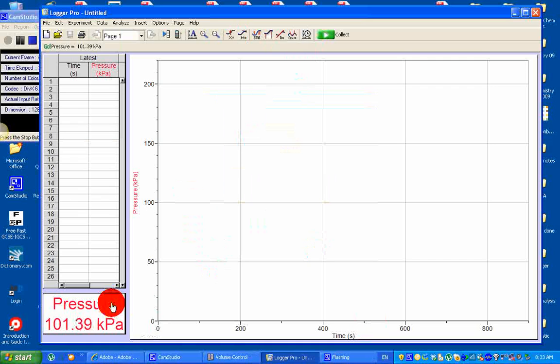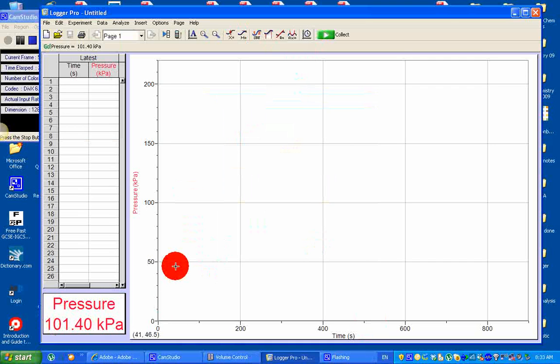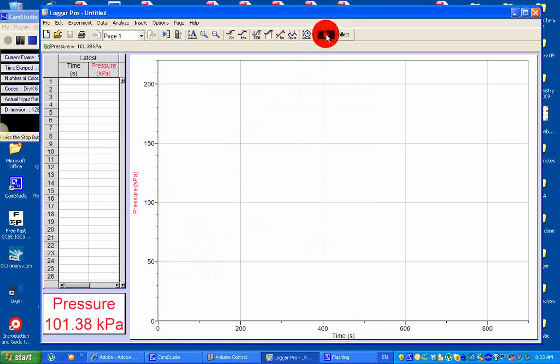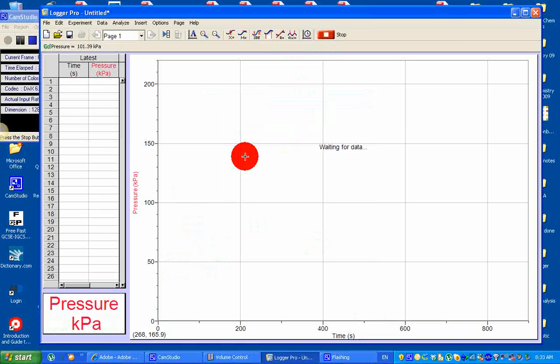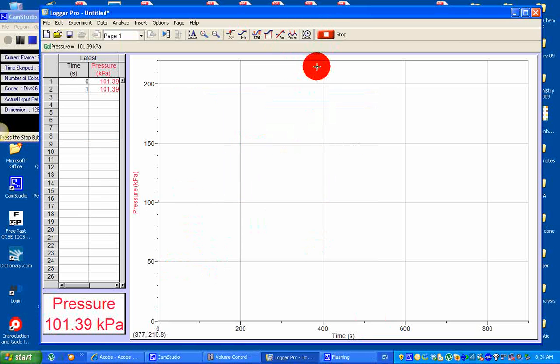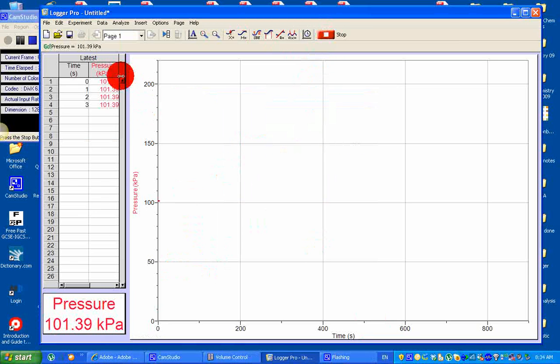Pressure is at 101 kilopascal before I add the magnesium strip. I'm going to start the collect button. Pressure is at 101 before I've added the magnesium strip. I'm going to add the magnesium strip now.